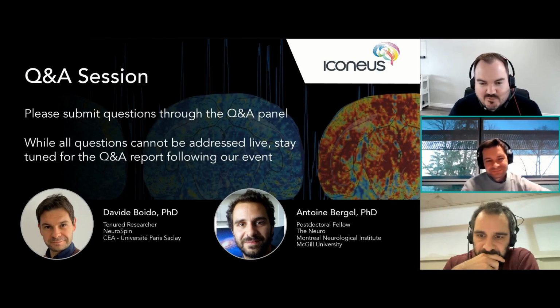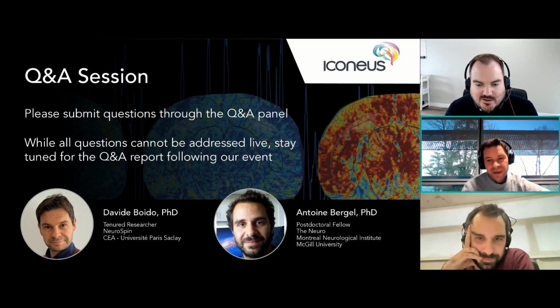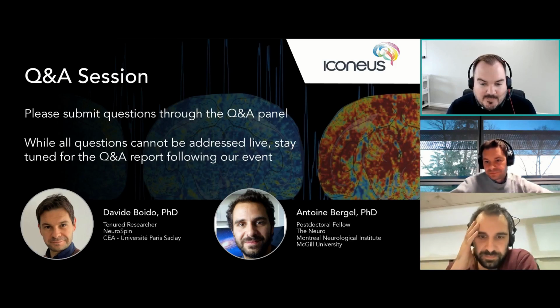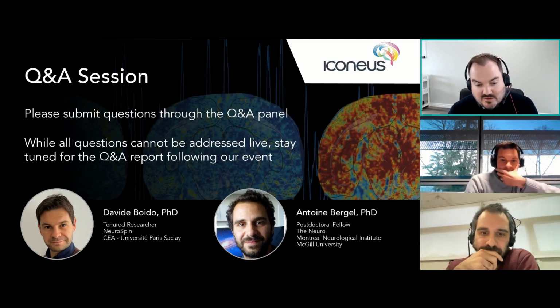Okay, wonderful. From the poll results, I see we have quite a few electrophysiologists joining us today. And we've had a number of questions related to interaction between the fUS and the electrophysiological signal, Antoine. So perhaps you can expand on that. Do the two interfere with one another in any way? How the fUS recording may affect the ePhys and vice versa?